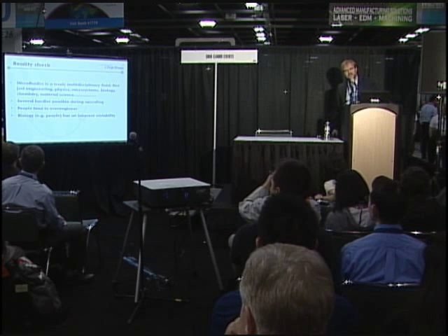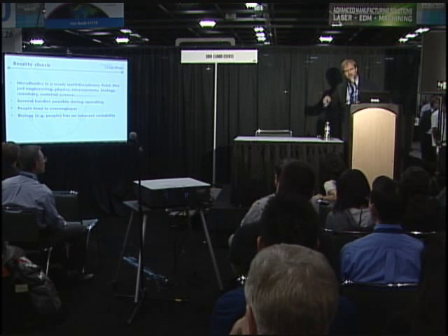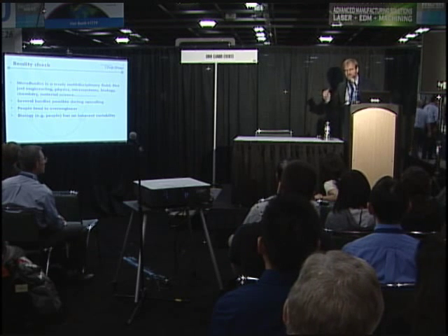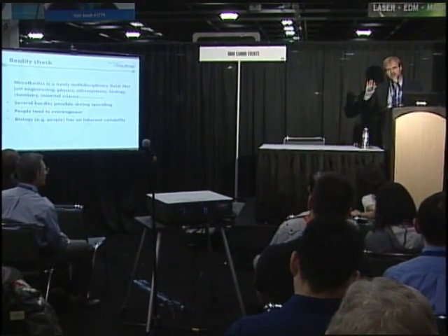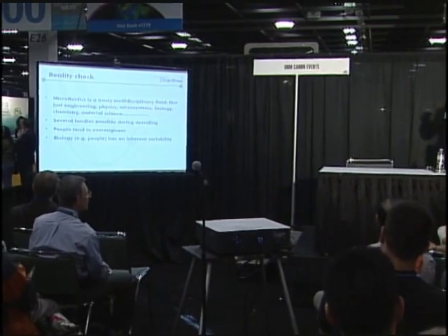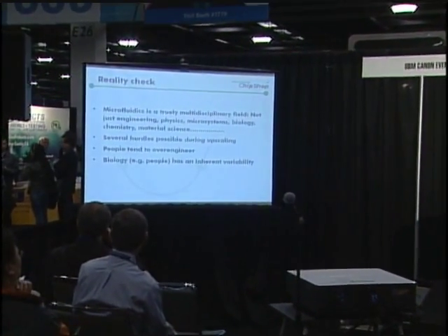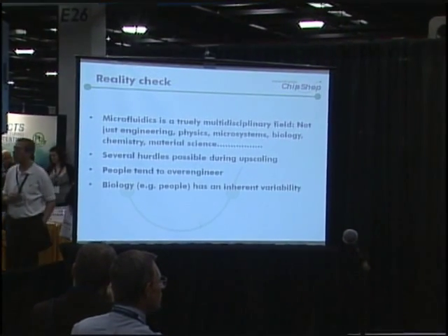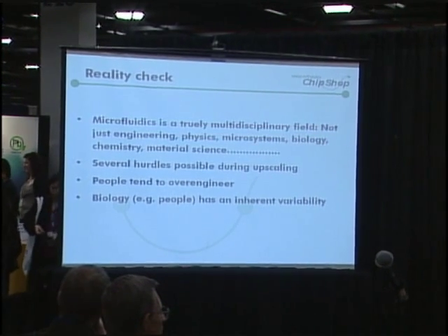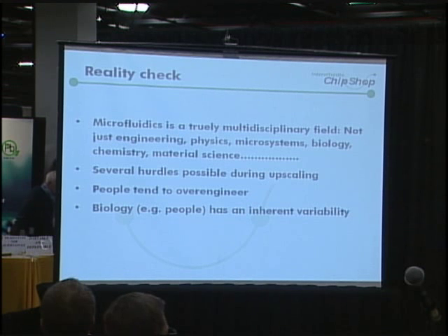One tendency we see a lot in Microfluidics is people tend to over-engineer. Oh, can't we make a 5-layer device with 37 integrated valves and stuff like that? Really bad idea if you talk about disposables, where eventually, even in high-value applications, manufacturing costs should be, you know, a few dollars a piece. Maybe Microfluidics is not the only field where that danger exists, but I'm a firm believer of the KISS principle. So make it as simple as possible, particularly if you're talking about disposables.